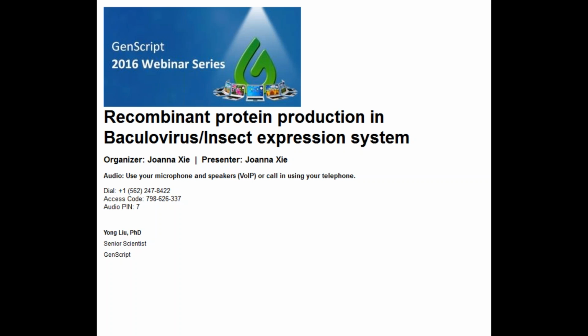As I said, we recommend performing a time course to determine the expression kinetics for recombinant expression, as many proteins can be degraded by cellular proteases that are released in cell culture. Maximum expression of secreted proteins is generally observed between 30 and 72 hours, and for non-secreted proteins, it's between 48 and 96 hours post-infection. You could also supplement the culture post-infection with 0.1 to 0.5% FBS or BSA to protect the recombinant protein from proteolysis, although we generally culture cells in serum-free conditions.